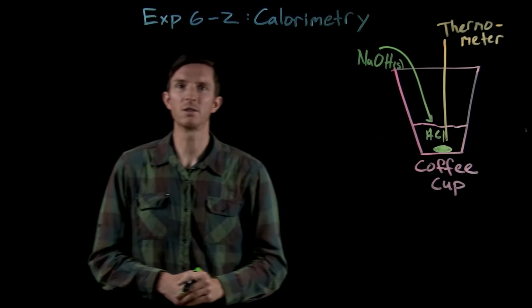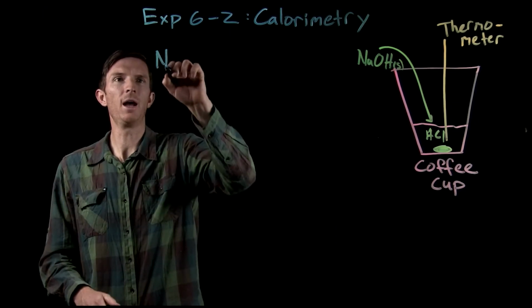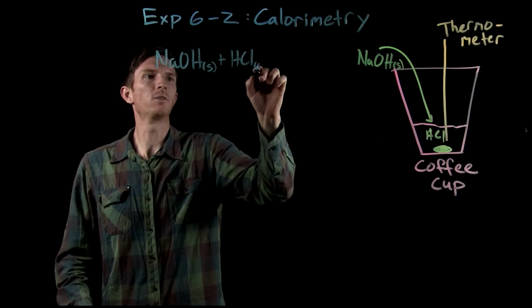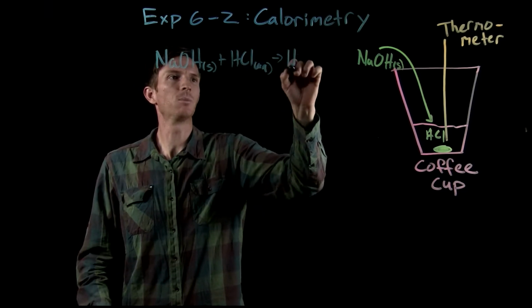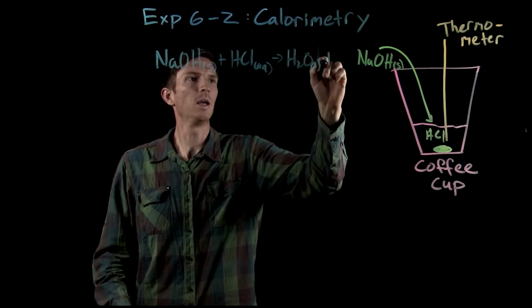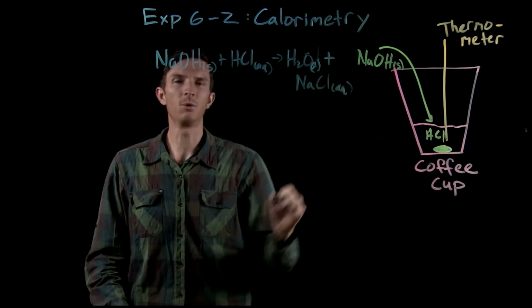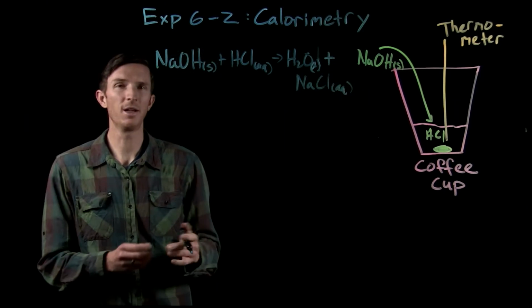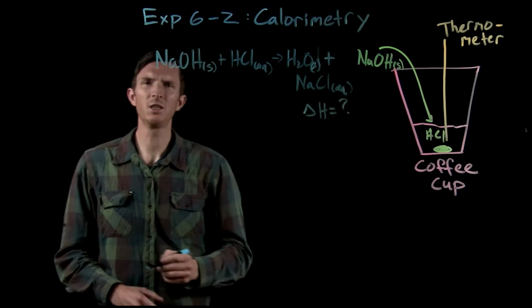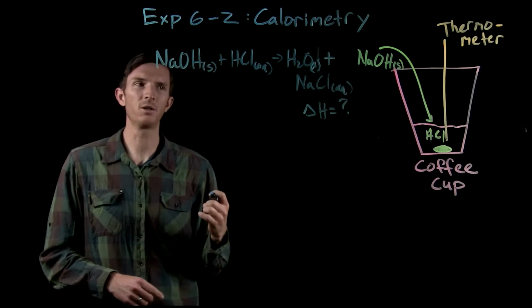Now maybe in this one reaction we look at our sodium hydroxide solid, and so the reaction that we'll have is solid sodium hydroxide plus hydrochloric acid, and that's going to produce water and our salt, sodium chloride. Okay, so when this reaction happens, what we want to determine is the enthalpy of this reaction. Is heat evolved or is heat absorbed when this reaction occurs?